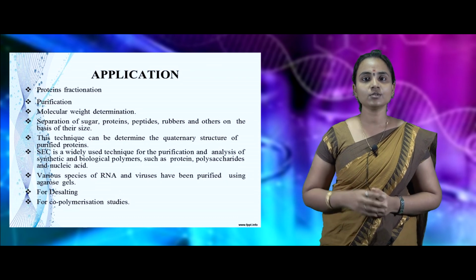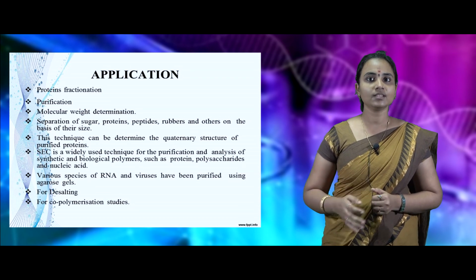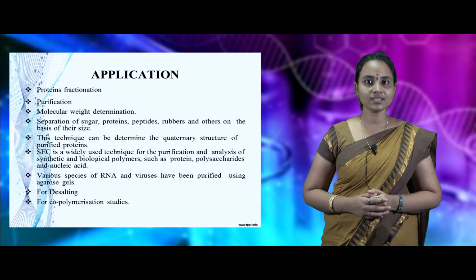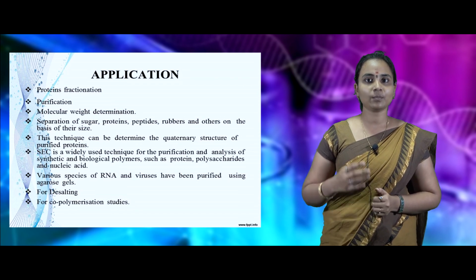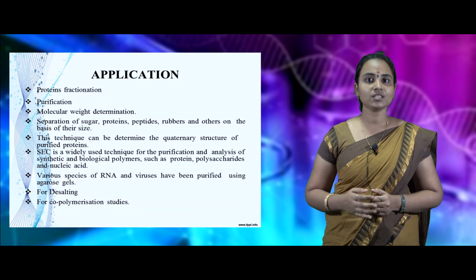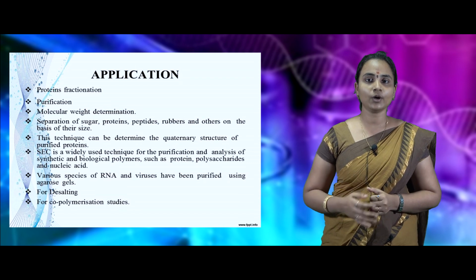In this, we can also separate different proteins, biomolecules and rubbers of different sizes, and it can be used to determine the quaternary structure of different proteins, and to separate different polymers based on their sizes. We can also separate viruses and RNA of different biomolecules.